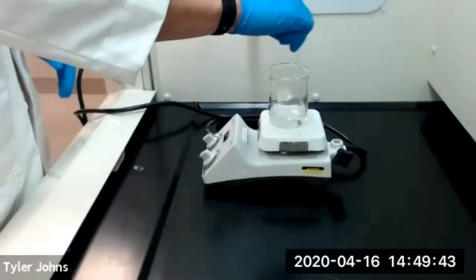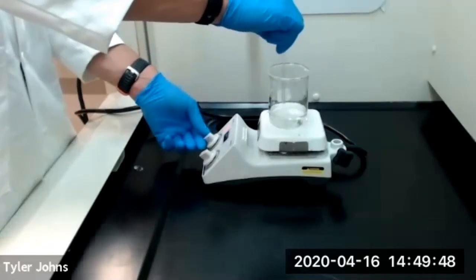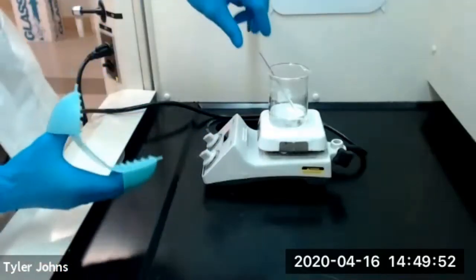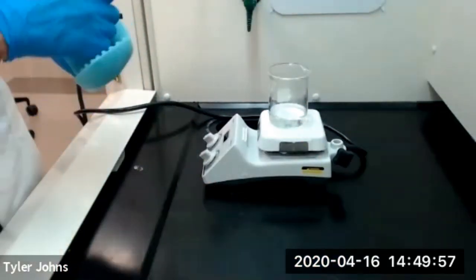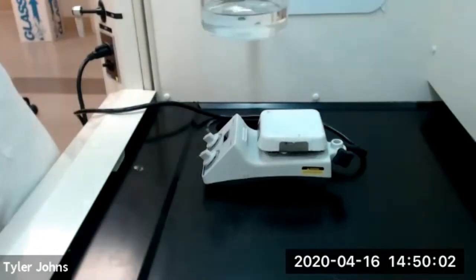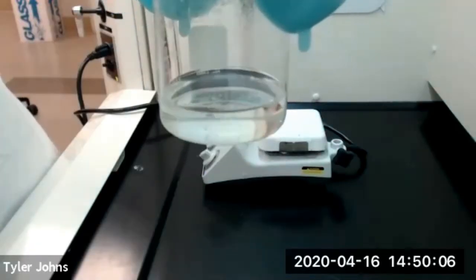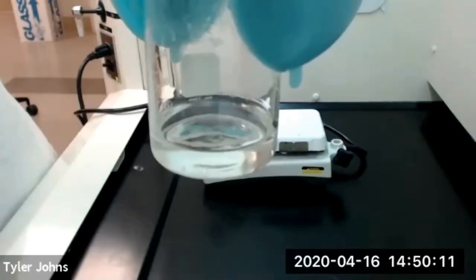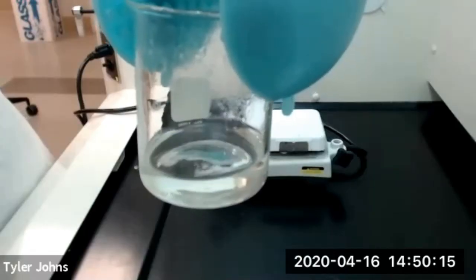Okay, so at this point, we've been heating our solution gently. I'm going to turn off the heat because we've now significantly reduced the volume to about 45 milliliters and we have a nice clear solution. So we're going to go ahead and place this in tap water to get it cooled, and then we're going to set it in an ice bath to induce crystallization.